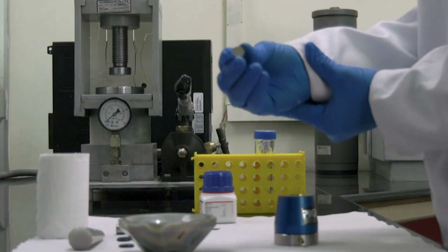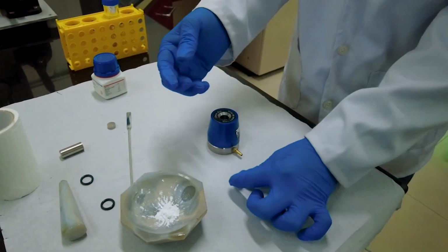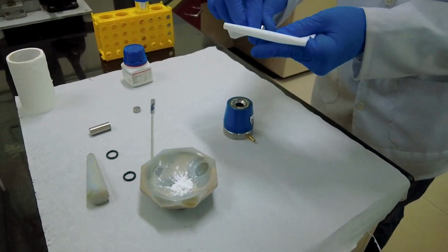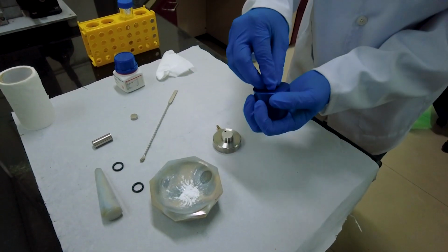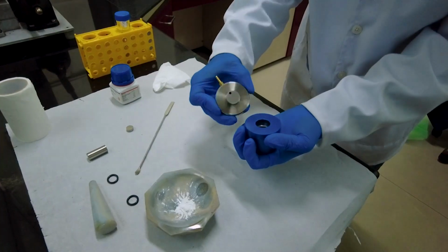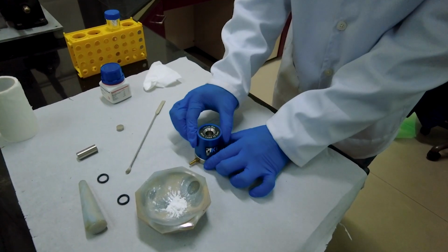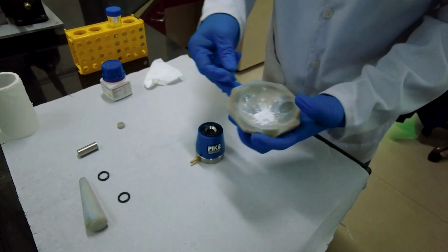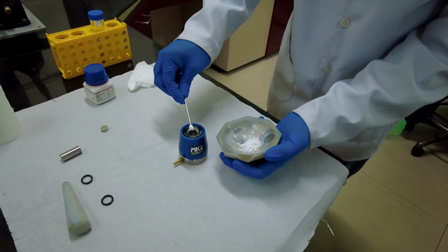Now to make the KBr pellet, first clean the parts of the KBr pelletizer using tissue paper. Arrange the parts of the pelletizer as shown in this video. After the assembly of the pelletizer, add a few scoops of the prepared sample mixture.